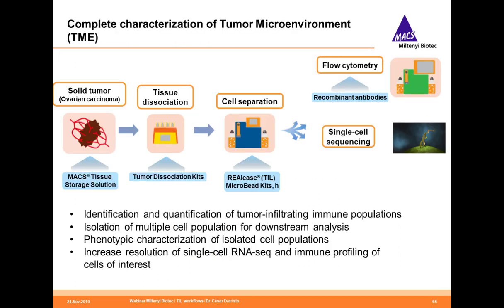With this workflow, we were able to identify and quantify tumor-infiltrating immune populations, isolate multiple cell populations for downstream analysis, characterize phenotypically the isolated populations, and increase the resolution of single-cell RNA-seq and immune profiling of cells of interest.